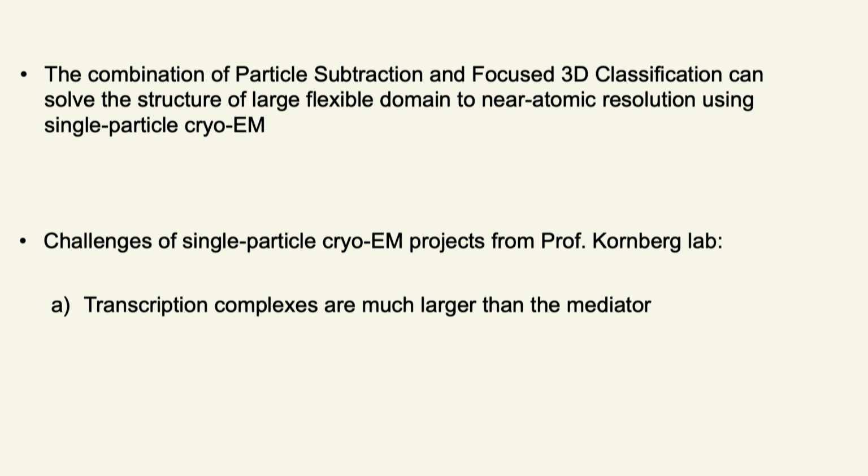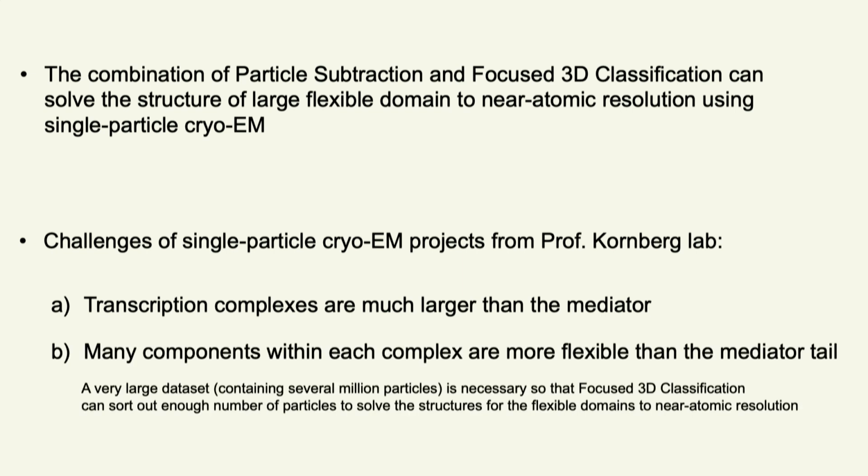So it's very big. Second, within each complex we are working on, there are many components that are very flexible, even more flexible than the Mediator tail I just showed you. So basically we have to collect a very, very large data set so that eventually we will have some particles left to solve the flexible domain to near atomic resolution by focused 3D classification.